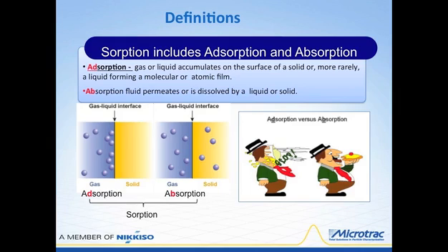The whole concept with adsorption is that if we provide an interface between a gas and a liquid, these gas molecules sitting out here to the left, due to their normal kinetic activity and motion and velocities, will strike the interface. And some of these molecules can be adsorbed or stick to that interface. Others will be removed. When we look at absorption, we'll see that these molecules can pass into the solid.